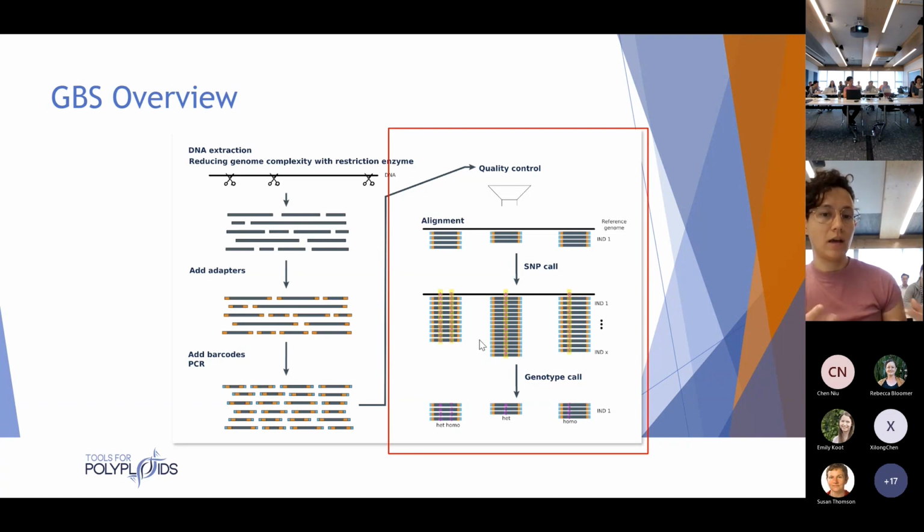And that's why Reads2Map was created: to try to find the best practices for this part so we can have good data for starting the linkage map. We do it in two ways: we use the map to see if we are doing this right, then we correct the process, then we do the maps again and see, oh, now it's better, and keep changing. But I needed an automatic, production-scale way to do that, and then we created Reads2Map.